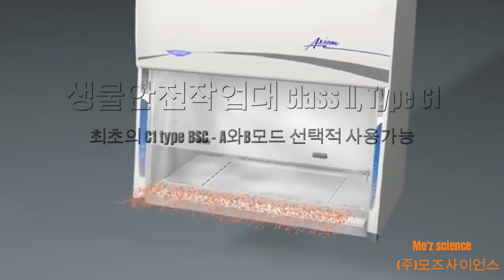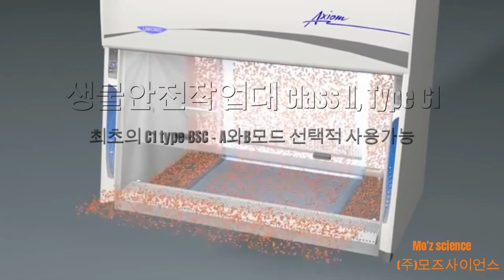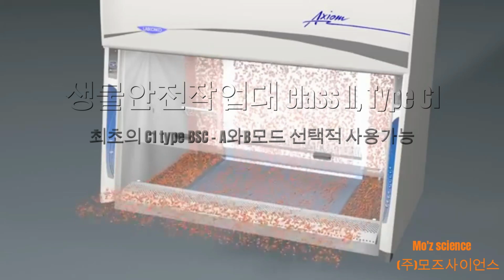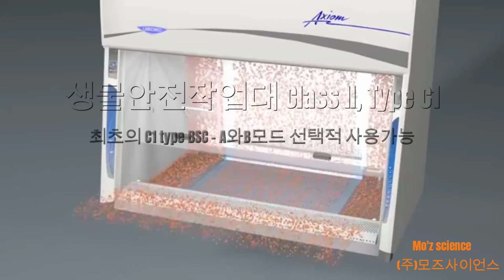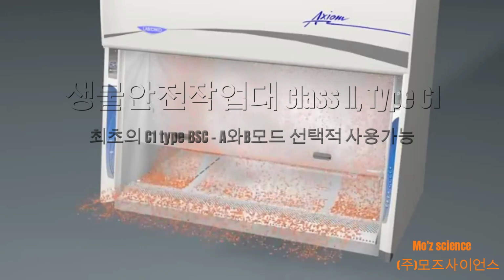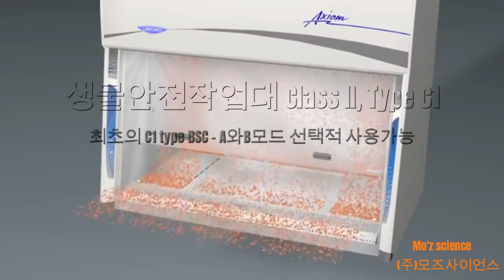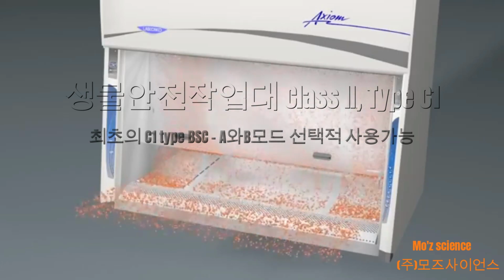Operator safety is maintained by negative pressure airflow into the cabinet, drawn below the work surface into the air inlet grill. This air mixes with downflow air at the wings of the cabinet and is drawn into the cabinet's air supply and pushed back down through the supply HEPA filter. Downflow air provides clean, laminar air that bathes the sterile work zones.